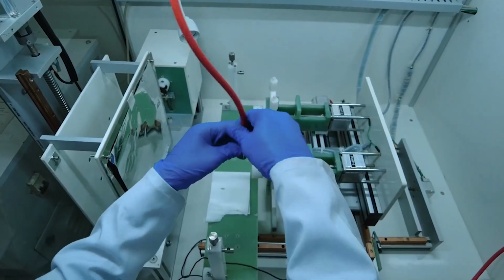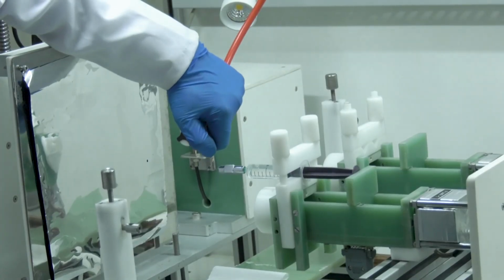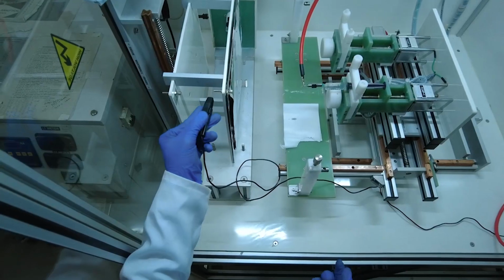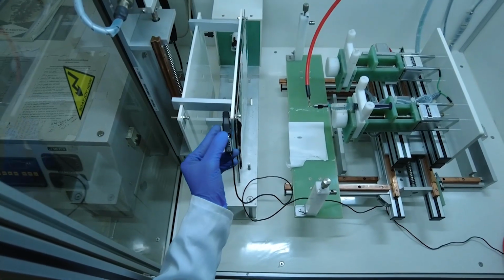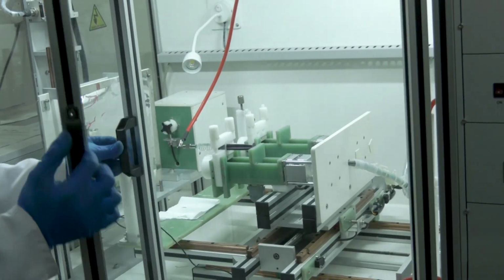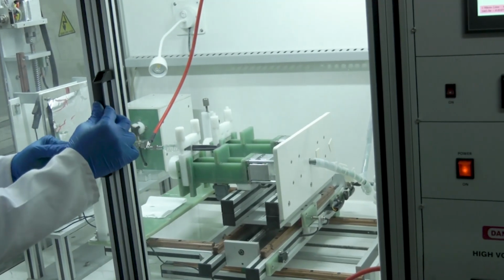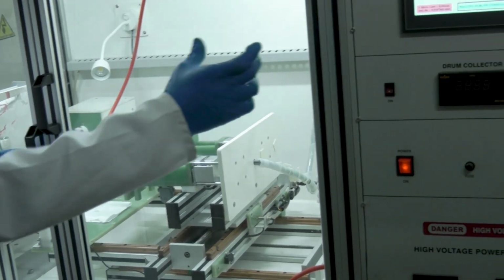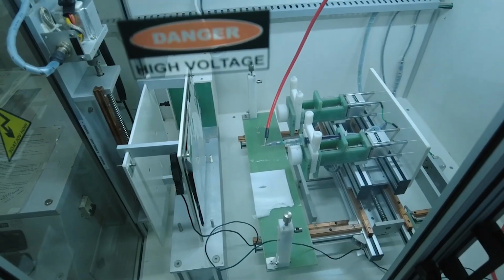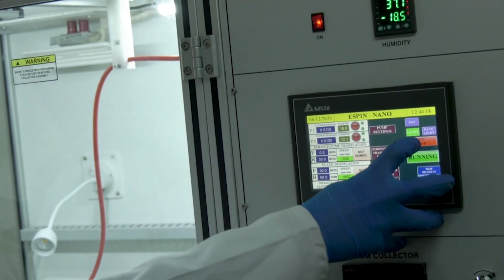Finally, attach the high voltage wire to the tip of the needle and connect the ground wire to the collector. Close the door. Turn on the pump and initiate the process. We can now observe the formation of the Taylor cone and the deposition of nanofibers on the collector.